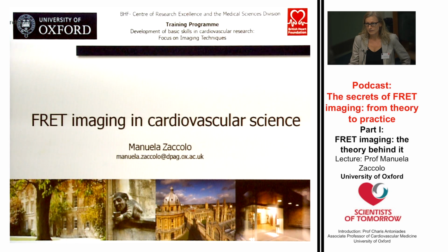I will then give you a couple of examples taken from work that we have done in my laboratory to give you a flavor of what type of information you can obtain with this type of approach. And in the last part of my presentation, I want to guide you through a few really basic considerations that one should keep in mind when thinking of developing a new FRET reporter.